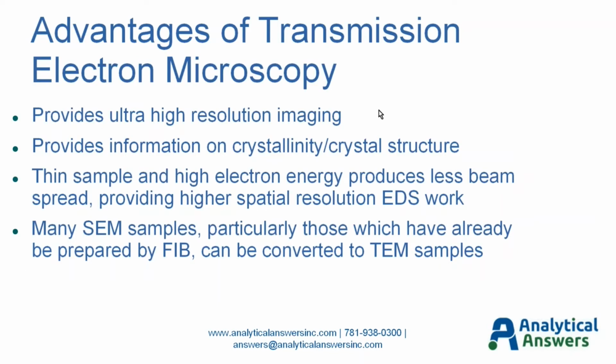So wrapping up here, advantages of the TEM. Hopefully I've shown you that it does provide an ultra high resolution imaging capability. In addition to that, we can get some information on crystallinity and the crystal structure itself. It's a thin sample by definition, and we are using a high energy electron beam.